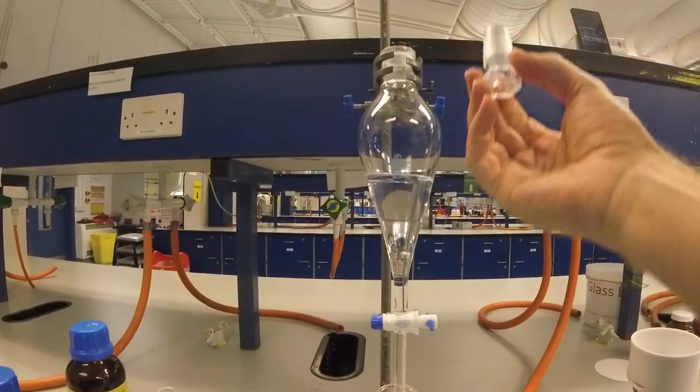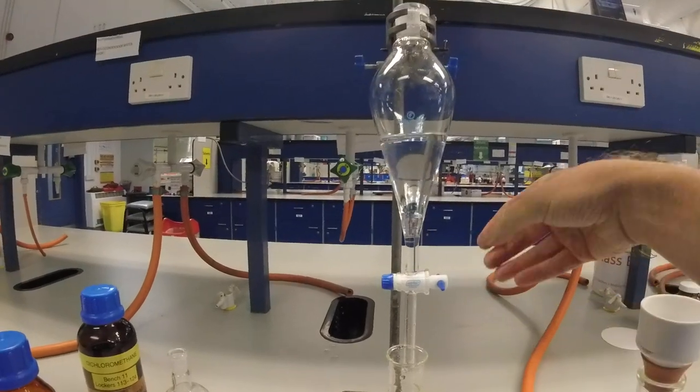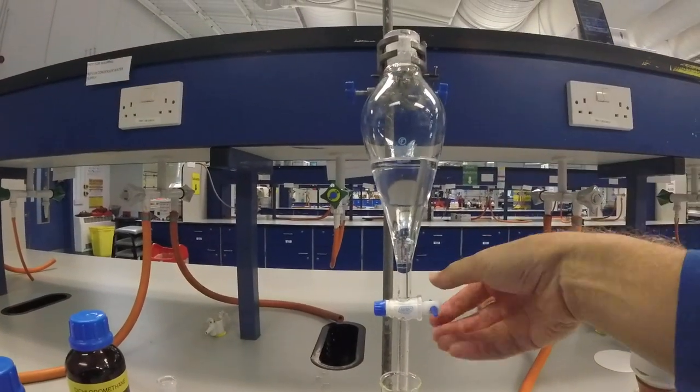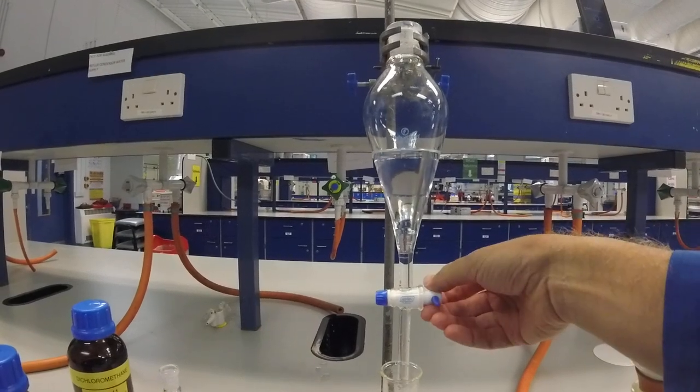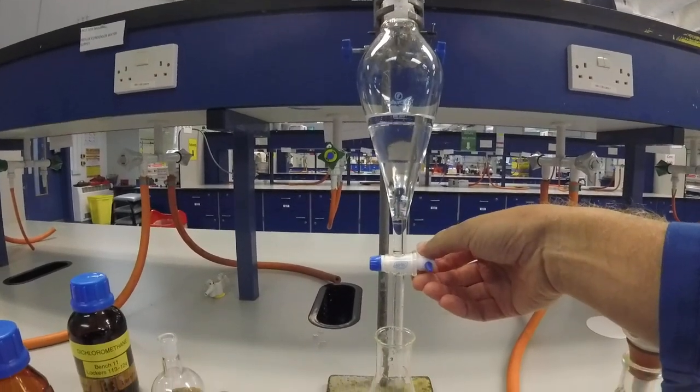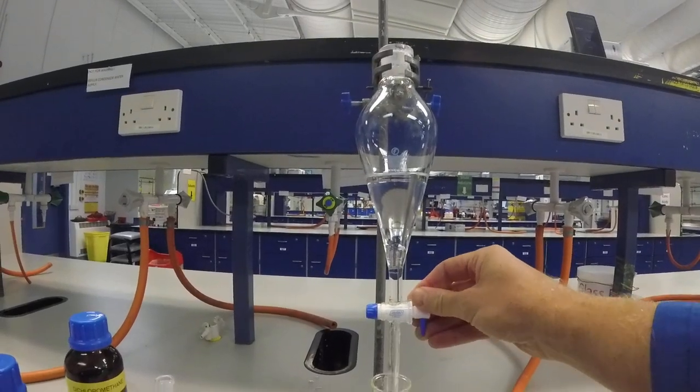Other important thing is make sure you take the stopper out. A number of people leave the stopper in and then when they come to open the tap they can't work out why anything's running out of the separating funnel. They think the separating funnel's broken. So now we then open and you'll see the layer moving down.